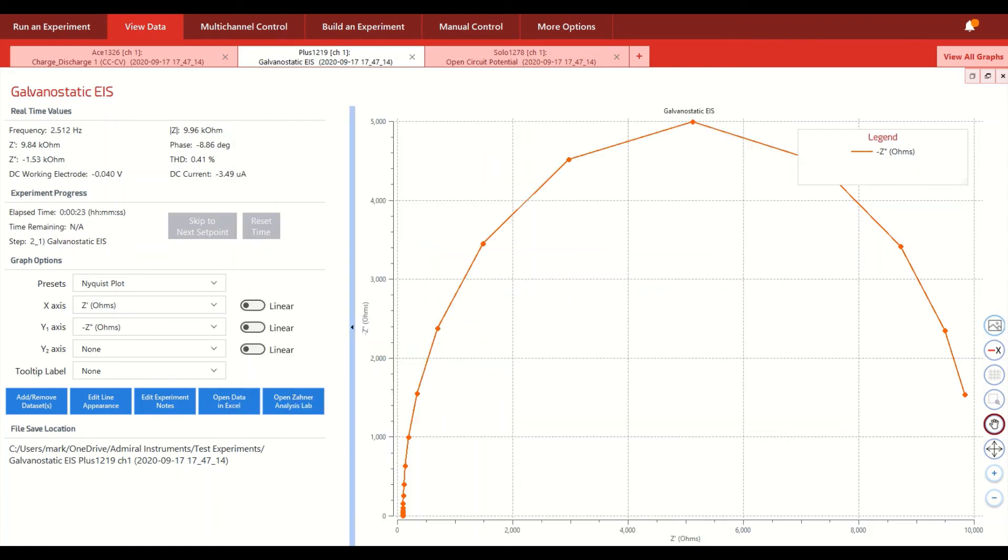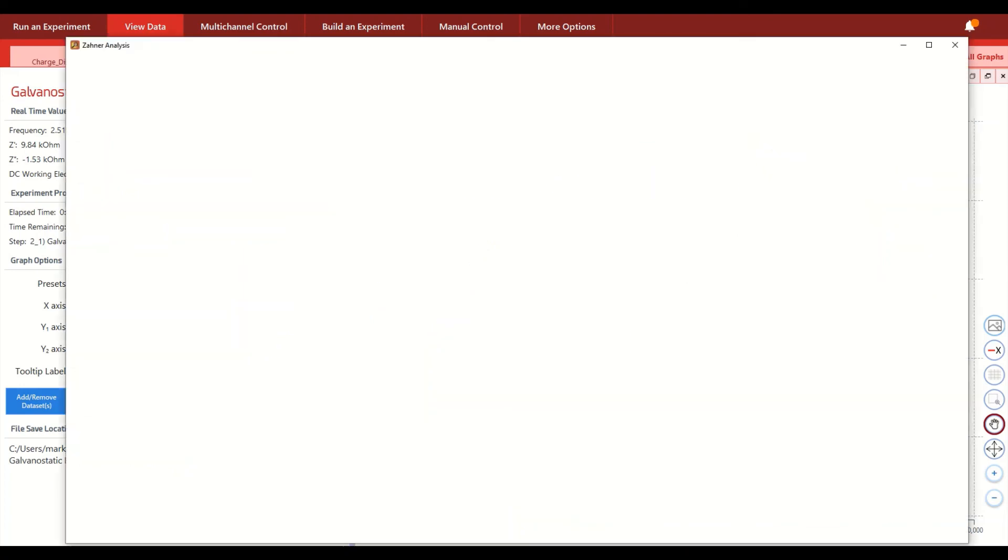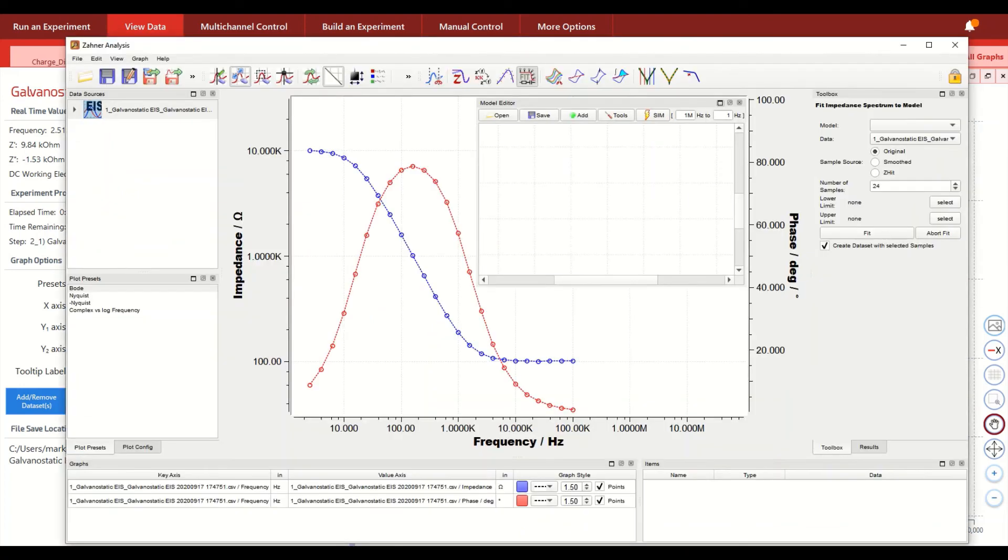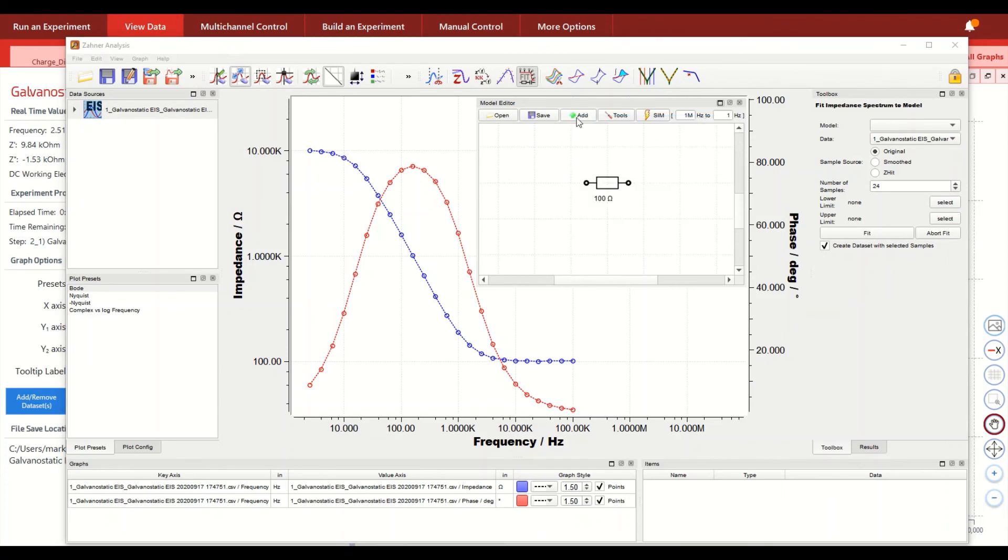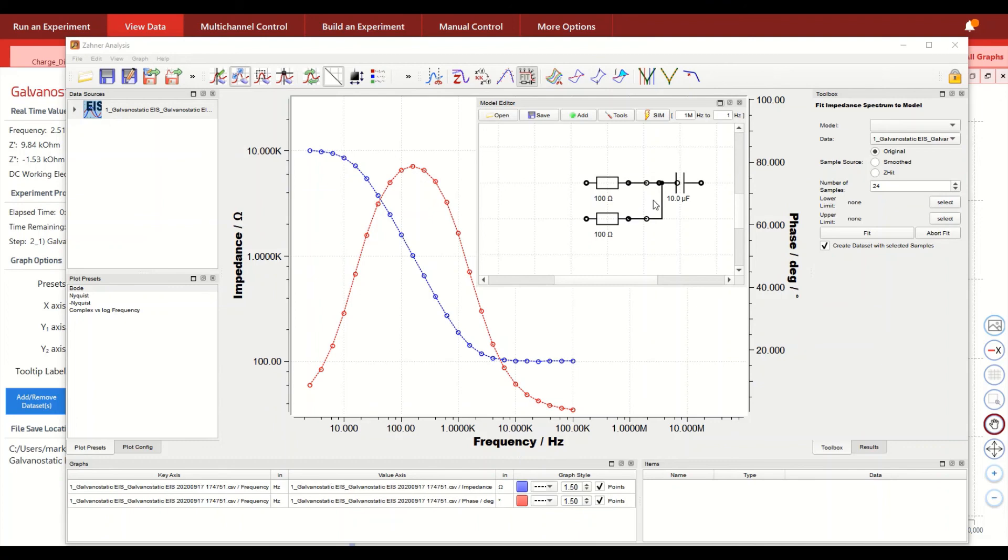For those of you that are particularly interested in doing data analysis on impedance spectra, we do offer an analysis software tool that's bundled with our Squidstat user interface software. So there's a button here for Zahner analysis lab. So we partner with a company called Zahner based in Germany that offers this software that can analyze EIS data with equivalent circuit models and it can analyze DC data too.